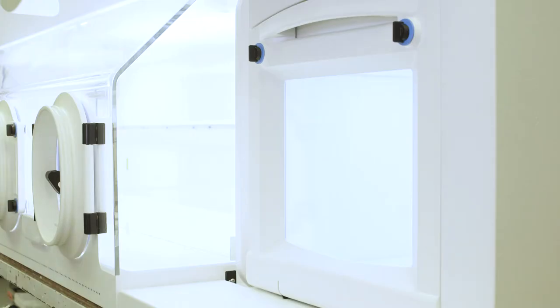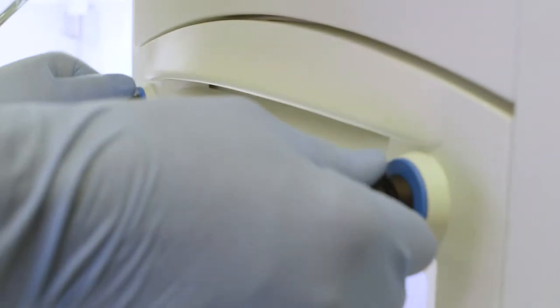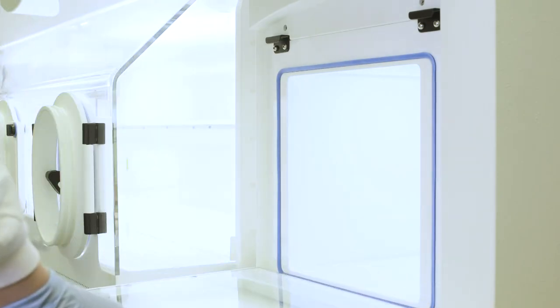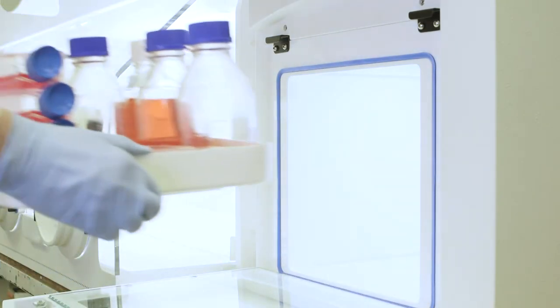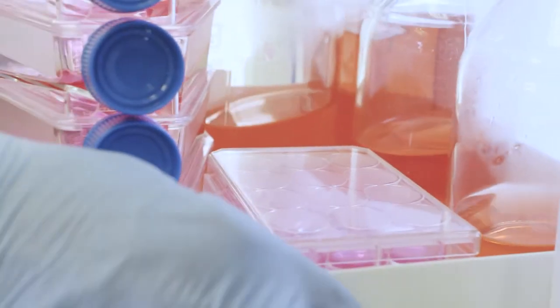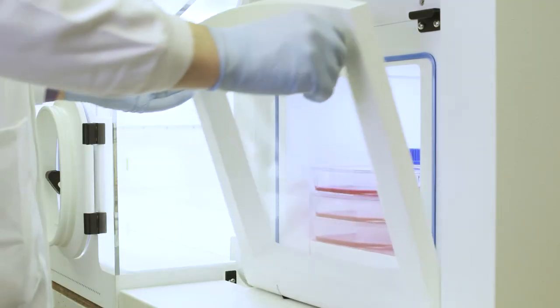Other hypoxic stations have a 30-litre airlock that enables a greater capacity of samples to be transferred into a hypoxic environment with variable airlock cycles that can be selected to match the O2 levels inside the workstation, ensuring optimized conditions and gas economy.